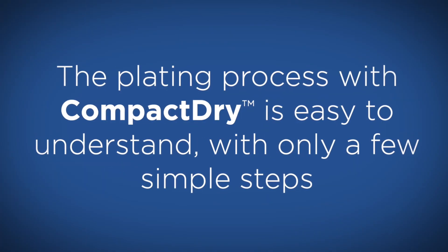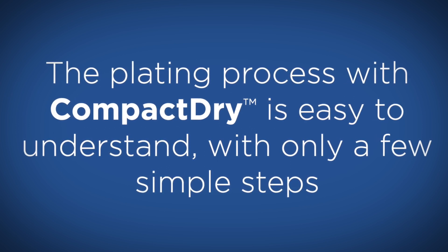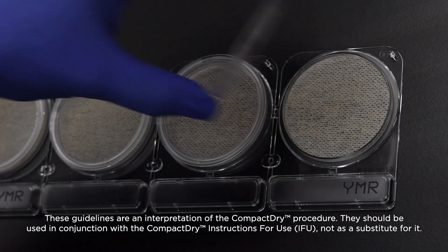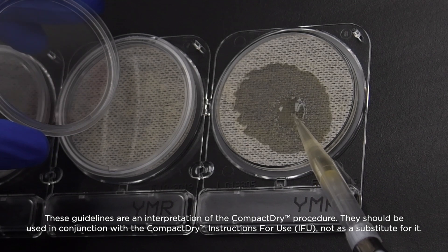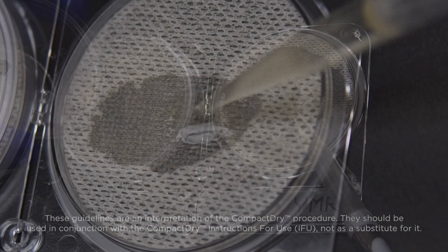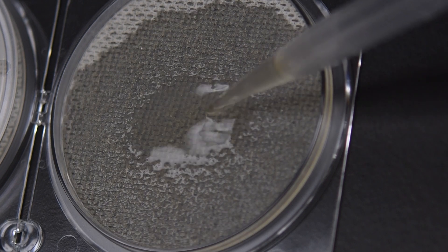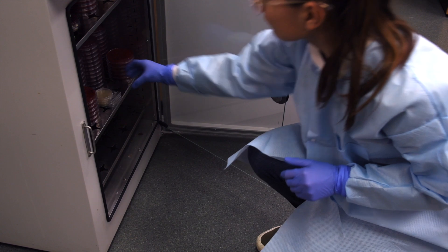The plating process with CompactDry is easy to understand, with only a few simple steps. Remove the protective lid from the CompactDry plate. Pipet 1 ml of sample in the middle of the dry media. Watch the sample diffuse automatically, transforming the dry media to gel. Recap and incubate for the prescribed time.